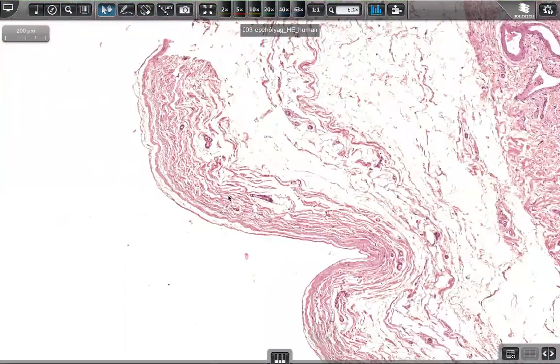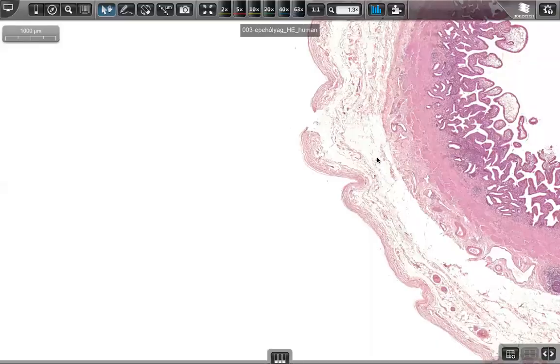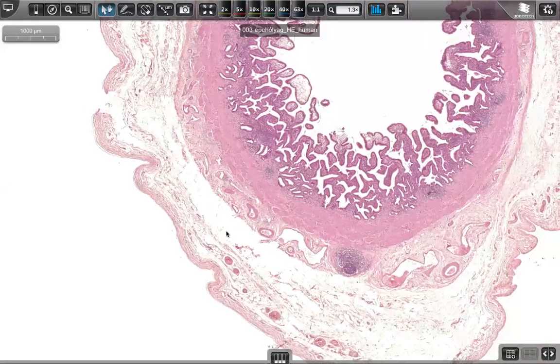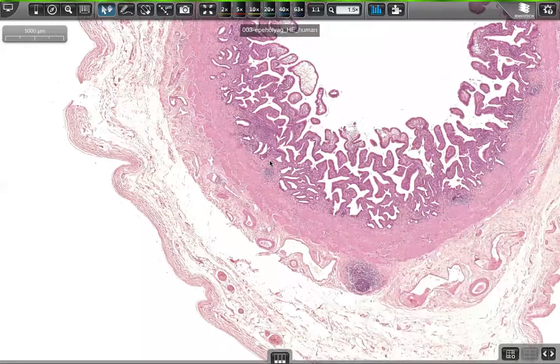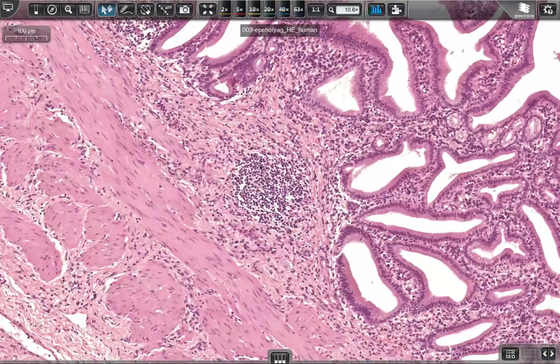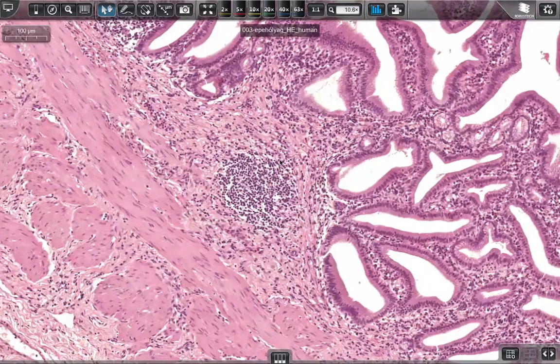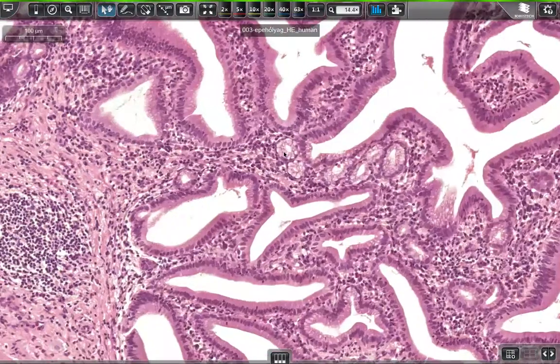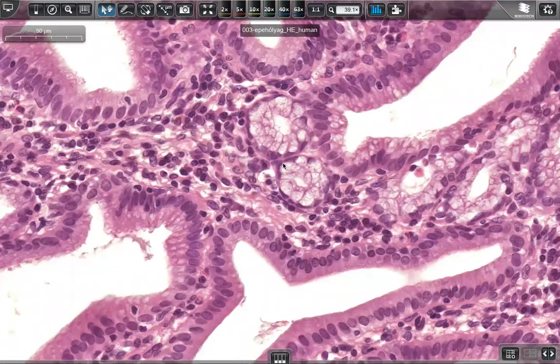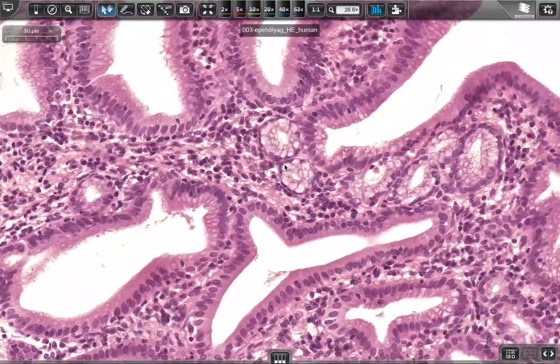So underneath we have a subserosa and connective tissue elements, but because of the preservation there is an artificial big gap. And definitely we can find some lymphoid infiltrations of the propria, and some glands are also present here. The cuboidal cells are typical for the glands.